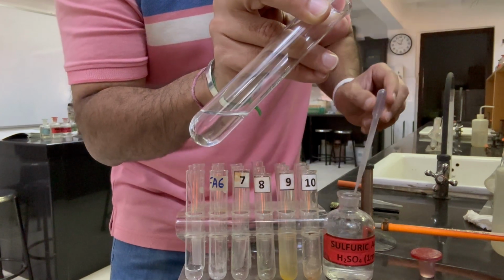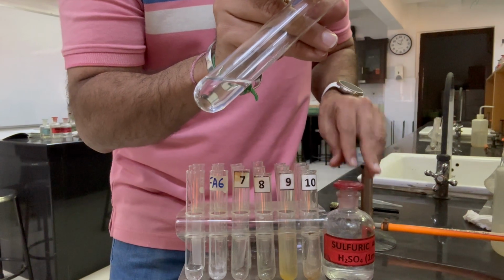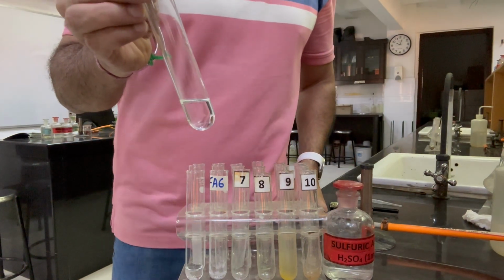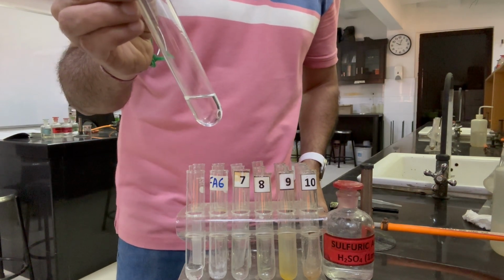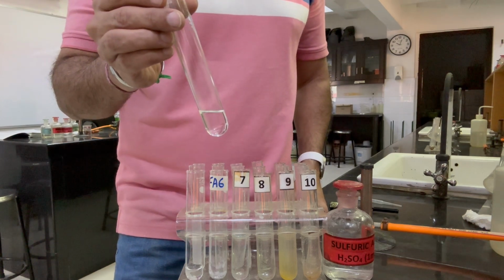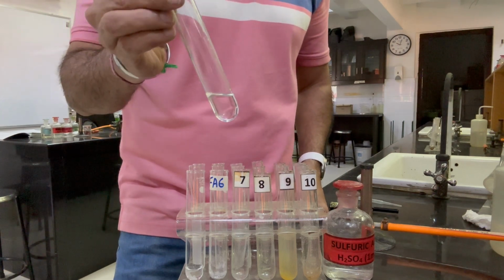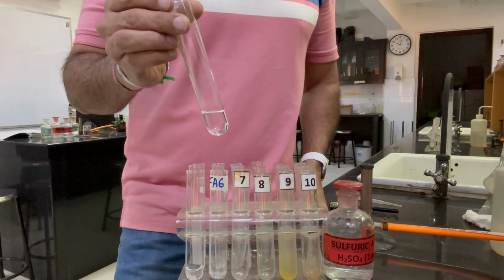But if we realize we have added sulfuric acid to sodium sulfite, it means a mixture of sodium sulfite and sulfate is produced. Now they have said heat or warm this gently. It means when the sodium sulfate and sulfite present in the solution are heated, sulfur dioxide will be produced.